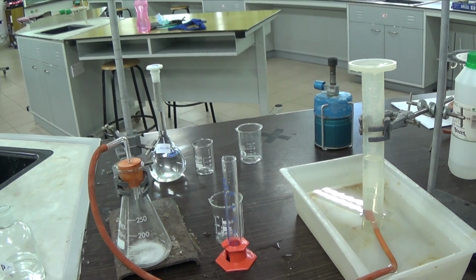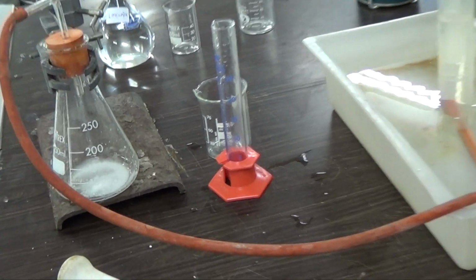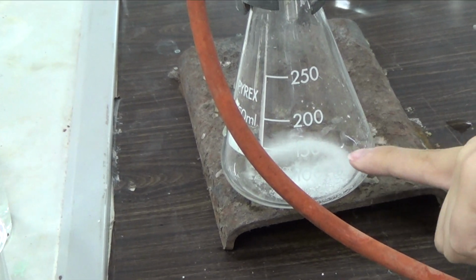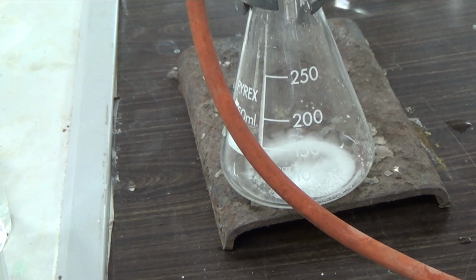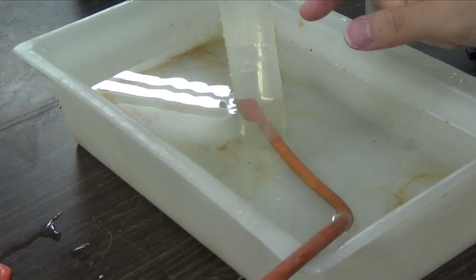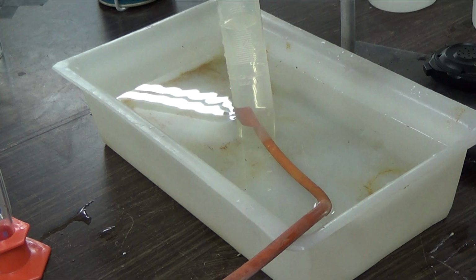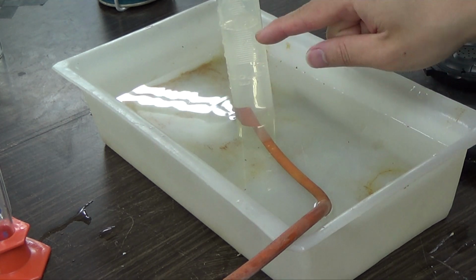Look at what happened in the conical flask. So the conical flask, almost all the solid is gone. If you look carefully, almost all the solid is gone. There is still bubbling because there is still gas being produced. Not only are the bubbles there, but the bubbles are also on the measuring cylinder here. So the gas is being produced a bit slower now. It was really fast at the beginning. Suddenly the volume dropped a lot, but now it's getting very slow, but there is still bubbling. It's just very slow now.